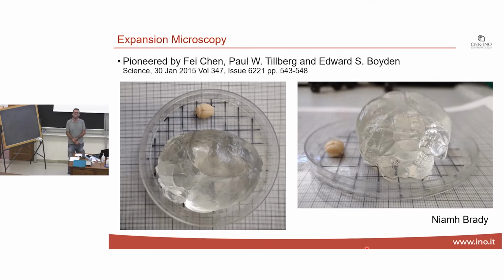I don't think it's feasible because these things basically work by diffusion anyways. So whatever bath you put your sample in, the molecules or the chemical need to be able to penetrate into the sample. So now I'm sorry if I can't be more specific, but it's not really my expertise.